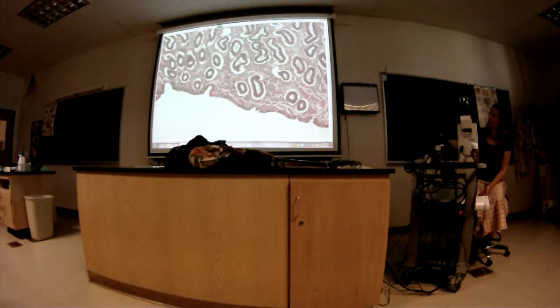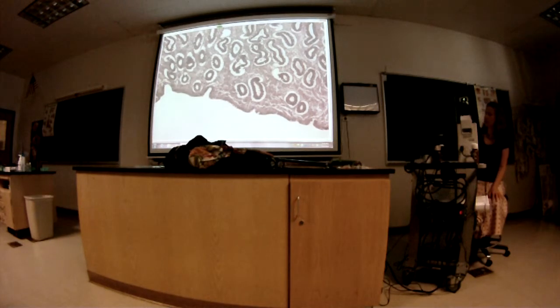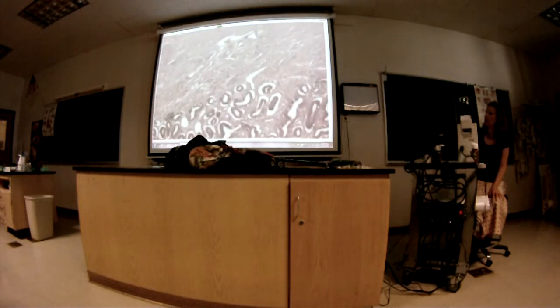So this is the epithelium right here. It looks like it's got cilia, but it actually doesn't. It's simple columnar. It's probably just a bunch of gunk out there. So endometrium is from here, and it goes up, includes all that. And can you see where it changes? Yeah, right there. Okay, and then this is the start of the next main layer. What's this main layer? Myometrium. Myometrium, good. And what are these structures? Uterine glands. Uterine glands, good.